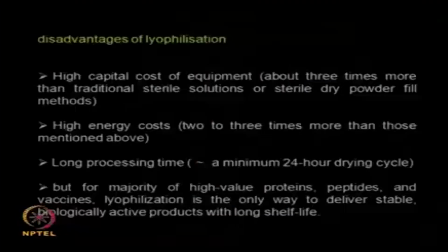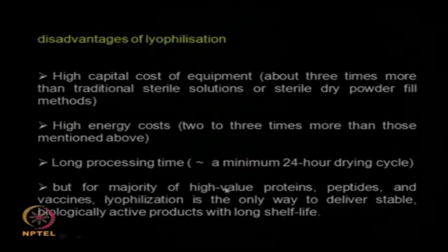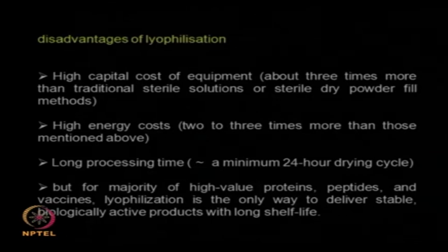So instead of 4 to 5 hours I may go to 24 to 48 hours. So these are the advantages and disadvantages of lyophilization, but for high value proteins, peptides, vaccines, this is the only way to give stable, biologically active products with long shelf life. There is no other go, you have to resort to this type of method. So far we talked about different types of drying and their advantages and disadvantages. So that completes another downstream operation.